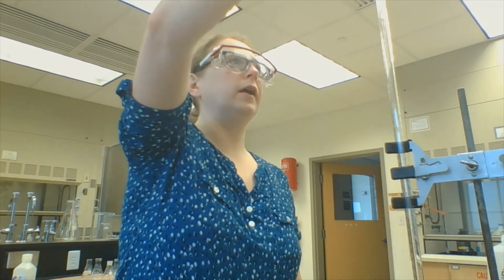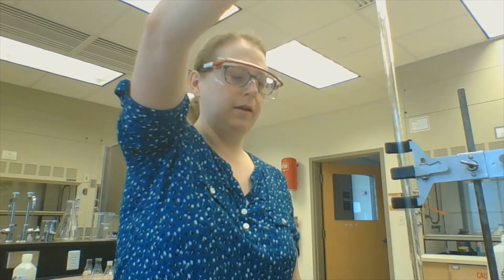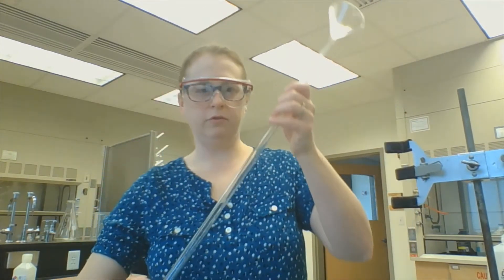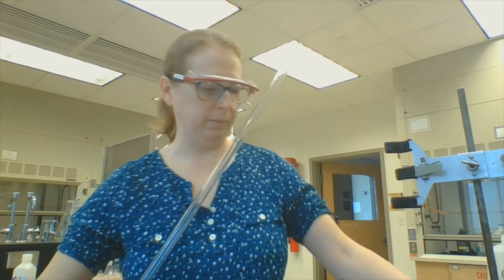But if I want to get good results, the first thing I need to do is rinse my burette a little bit. So I just pour in a little bit — not tons, less than five milliliters at this point.